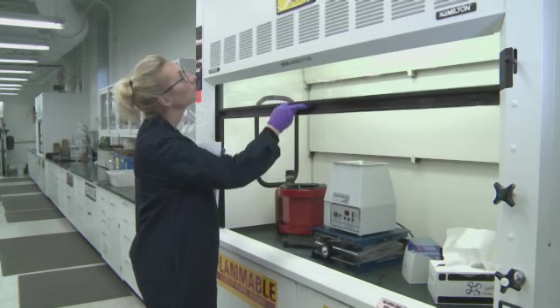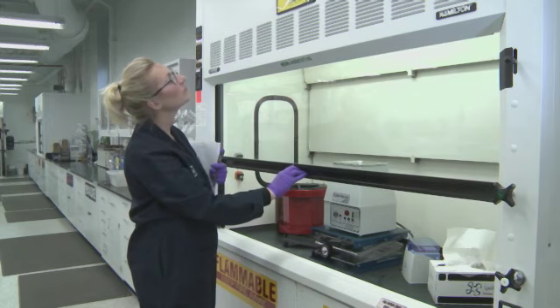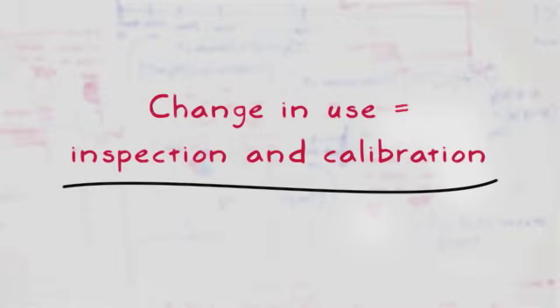And finally, Heather is planning to get the fume hood re-inspected and recalibrated. That's because she's going to use the fume hood in a different way. And any change in use, including adding new equipment or apparatus, could impact airflow.